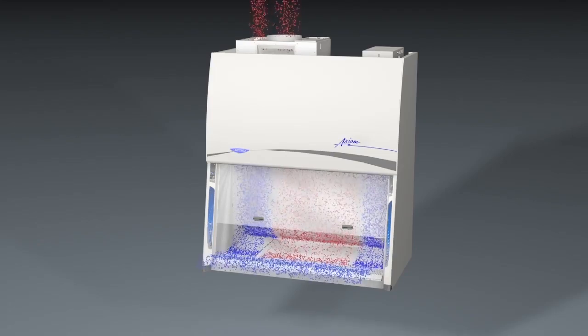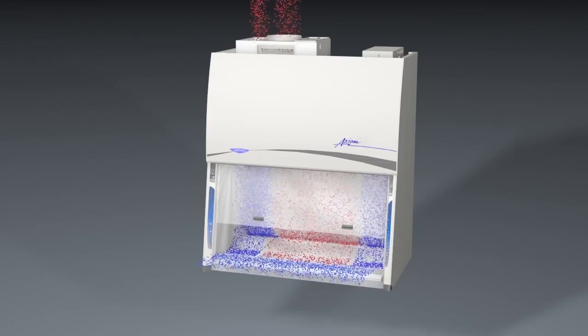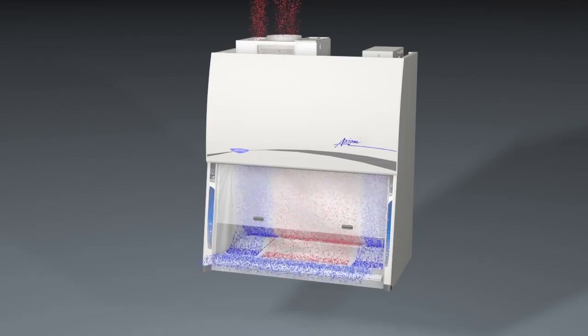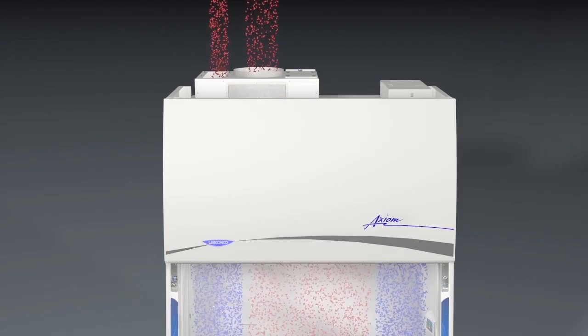During use, the air above the chemzone work surface is directed to the BSC's exhaust interface where it leaves the cabinet. In A mode, it leaves through the exhaust collar and bypass opening.